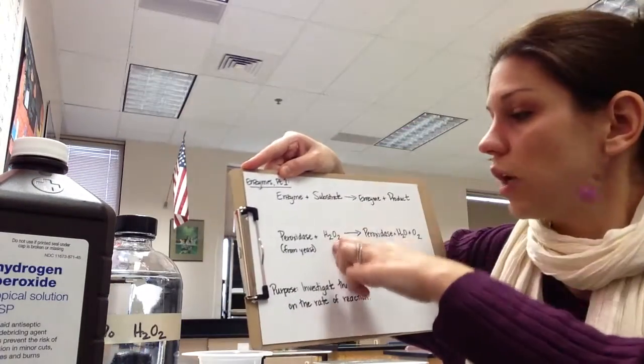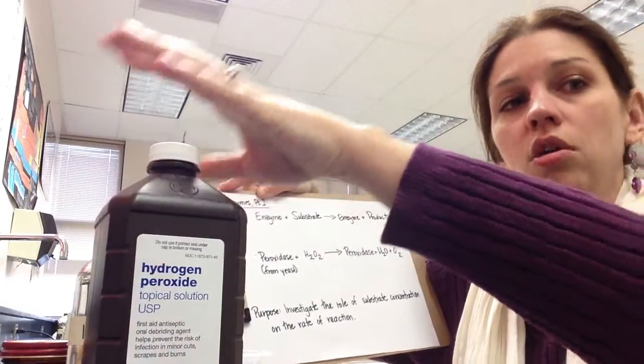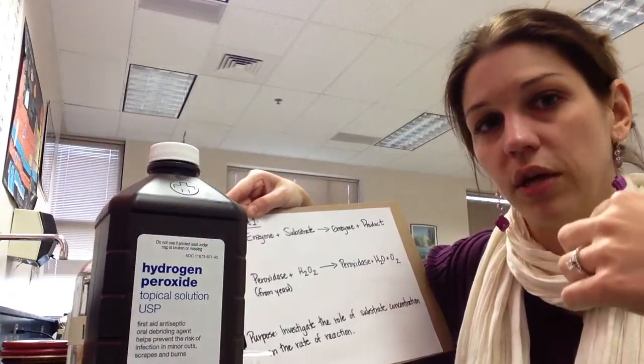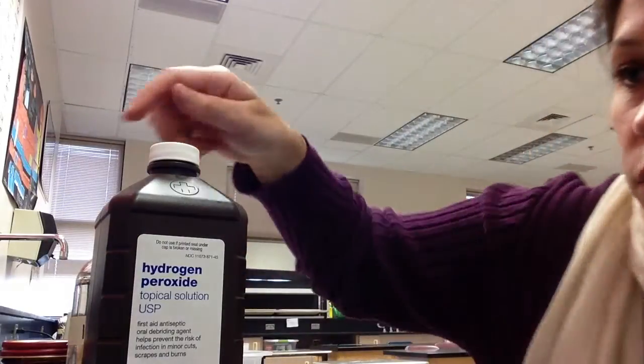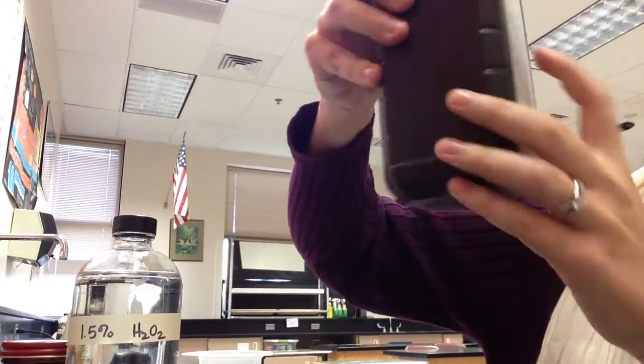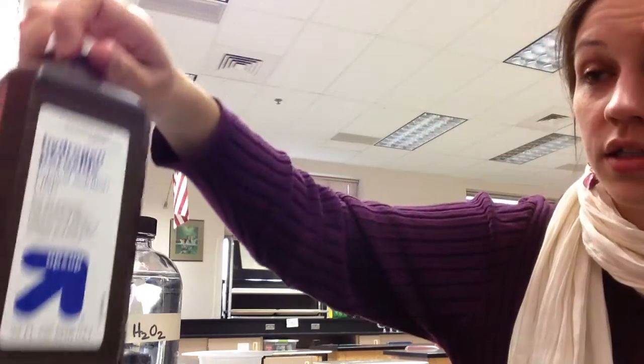Now, the substrate, again, is hydrogen peroxide, and I have hydrogen peroxide just bought from Target. When you buy hydrogen peroxide from the store, it is a 3% solution, and if you read the container very closely, it will tell you that. It tells you right there, 3% solution. So when it tells you to get 40 mils of 3%, that's just straight out of the brown bottle. I also took some and diluted it down to 1.5%, and so when it tells you to get 40 mils of 1.5%, it should be prepared like this.